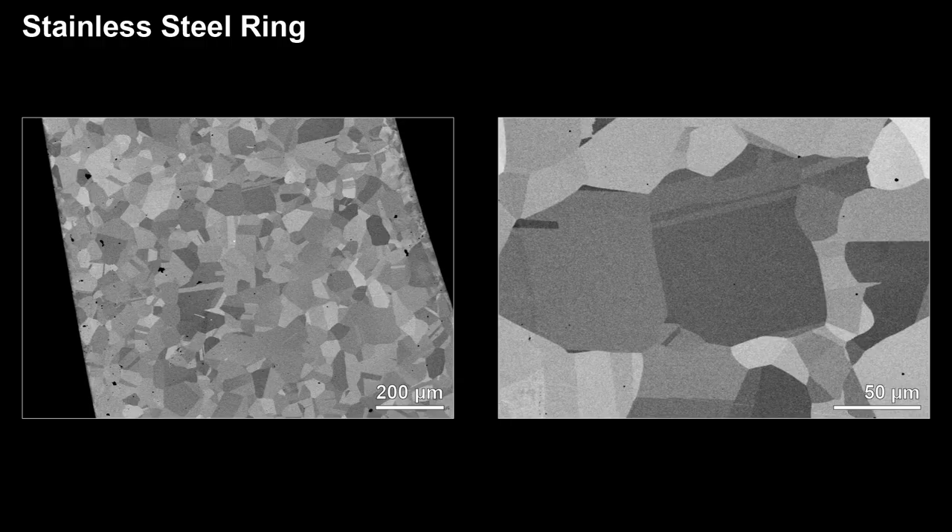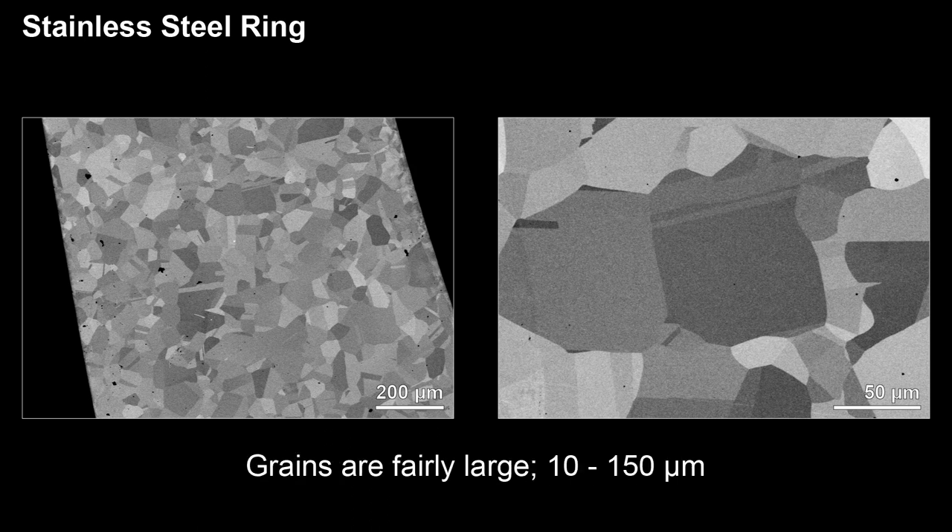Let's have a look at the stainless steel ring first. As you can see from the scale bar, the thickness of the ring is slightly over 1000 microns or 1 mm. Since the surface has been well polished, the contrast we are seeing here is crystal or grain contrast. Metals and alloys are polycrystalline materials, meaning they are made of many individual crystals or grains oriented differently with respect to each other. In these images, you can see the crystal size ranges from about 10 microns to 150 microns.